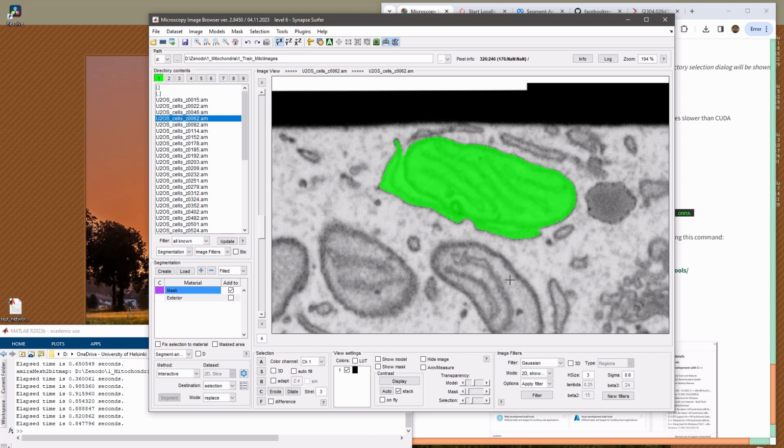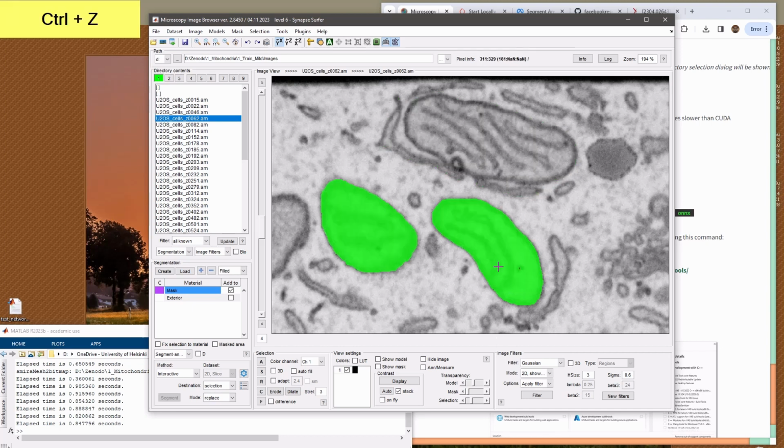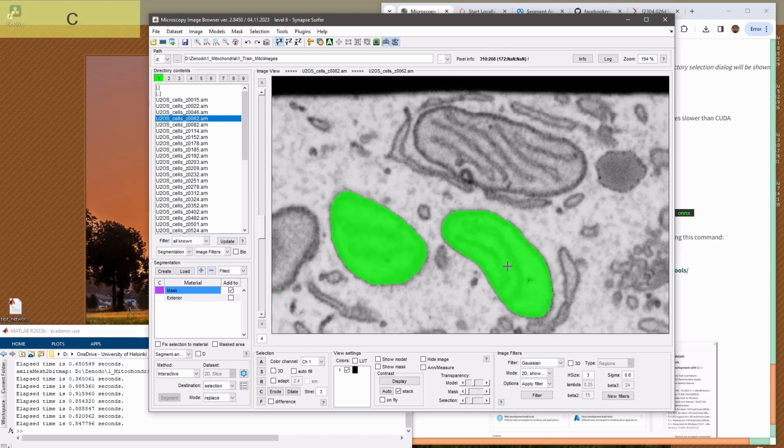And the way segmentation works, it only works on the part of the data which you see on the screen. So you see, if I move my window down, the part that was out of the screen was not really updated.